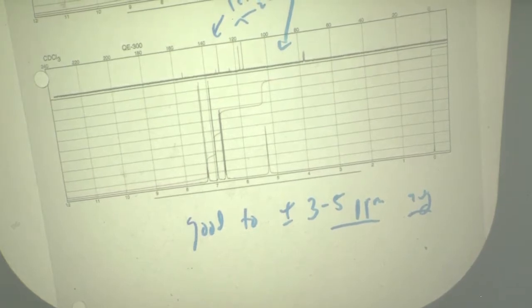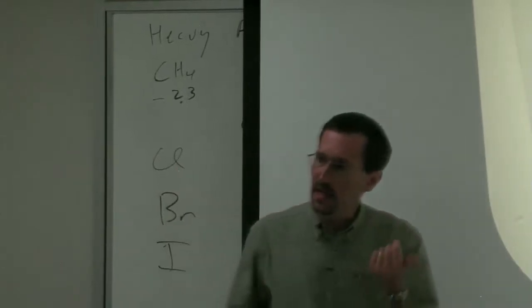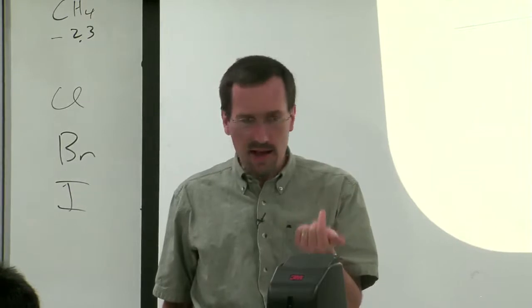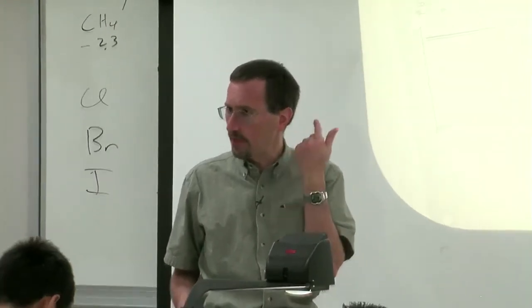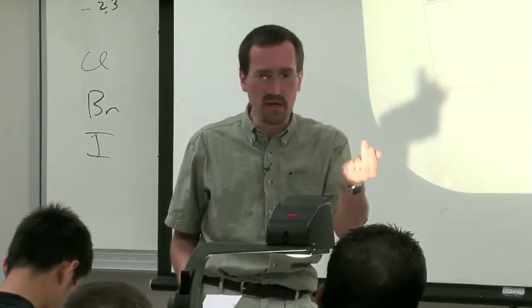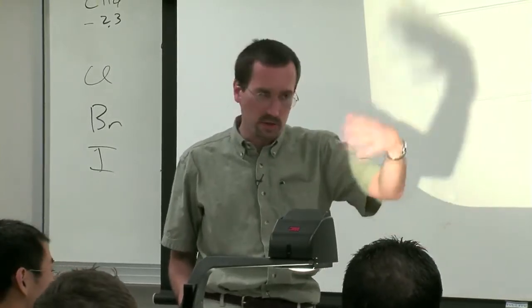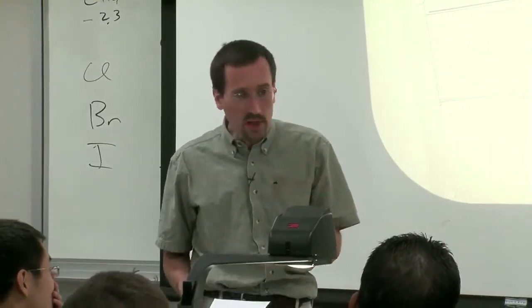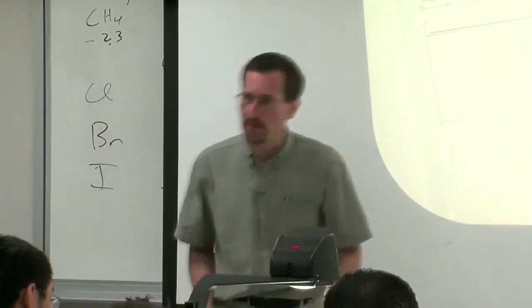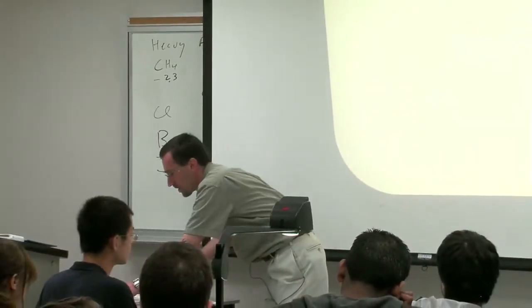All right. There are many, many more sophisticated ways of doing this. As I said, you can do this for aliphatic compounds as well. With aliphatic compounds, you've got to add up alpha effects, beta effects, gamma effects. There's even a little bit of delta and epsilon effects, so you have to look at the whole molecule. There's steric effects. You can do this easily by pencil and paper, but it's even easier to do it with computer software. And as I said, even ChemDraw in the more sophisticated versions incorporates this.